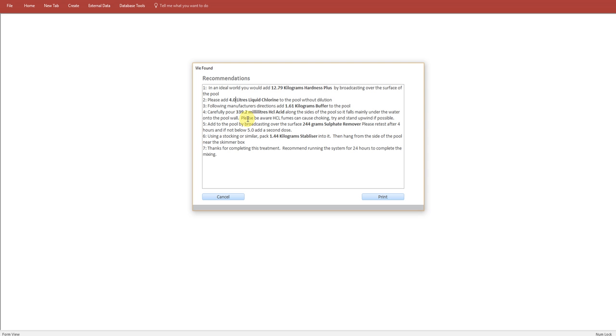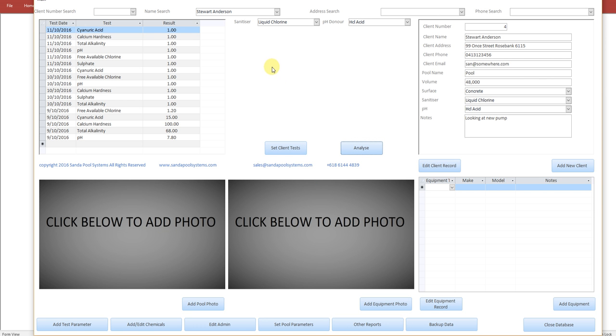I've turned on bold in the software as one of my clients has asked specifically for that to be turned on. I'm going to choose cancel. Do I want to save this test? Yes, I do. And that's it. Nothing there that you haven't seen before, I hope.